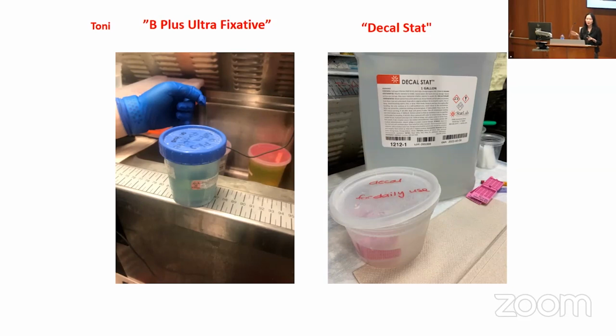Our process is about an hour for decal. So say we receive the specimen at 4 o'clock, it gets decaled for an hour, 5 o'clock. It must go on the processor at 6:30 in order to get to the next day slide form, right? So I always try to get the clinicians who are getting the sample to us to give it to us before that time period. Because if it is being decaled at 6, you can imagine it doesn't go on the processor that night, right?